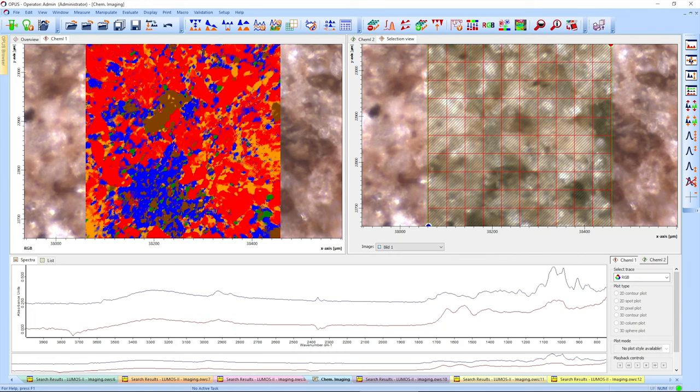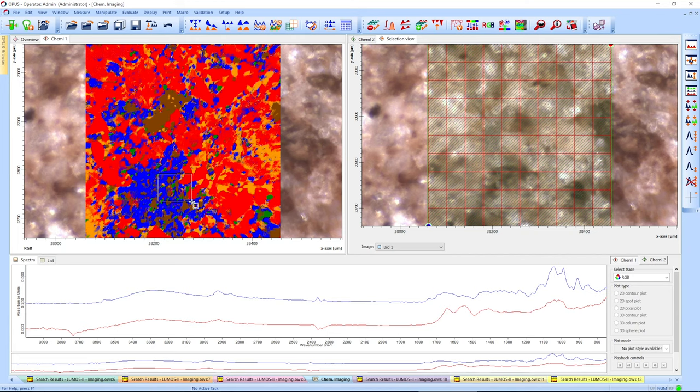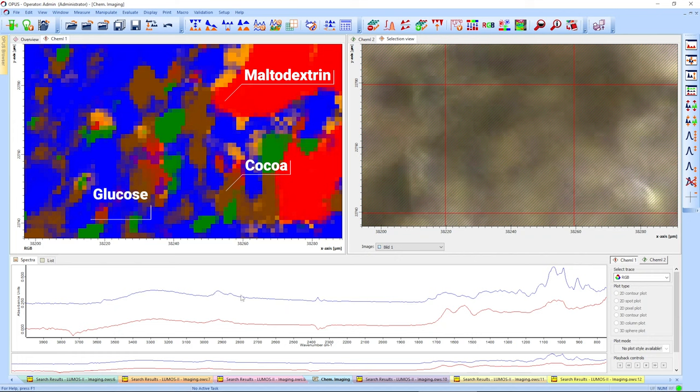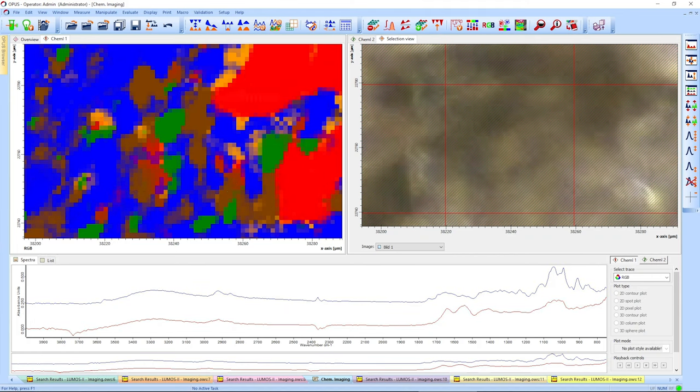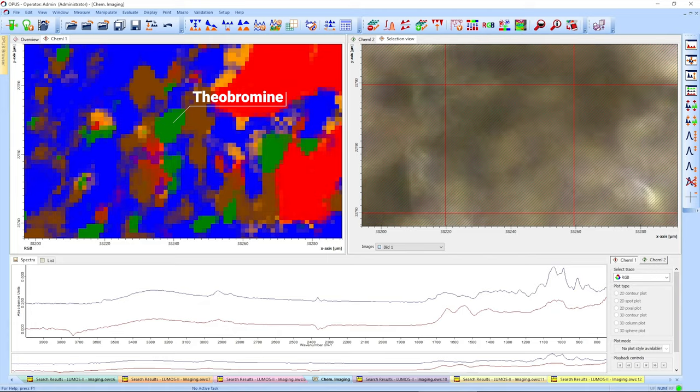Using a reference library, the actual ingredients can be assigned to the spectral signals. Melted dextrin in red followed by cocoa powder in brown and glucose in blue. The yellow marked area is identified as lecithin. And even this small green particle is fully resolved and identified as theobromine.